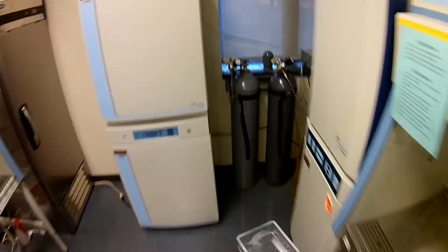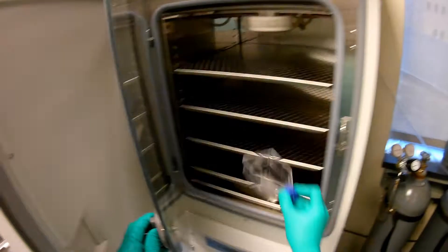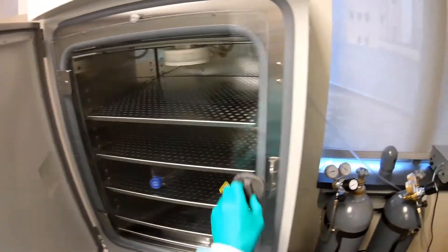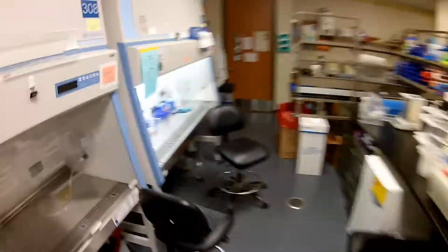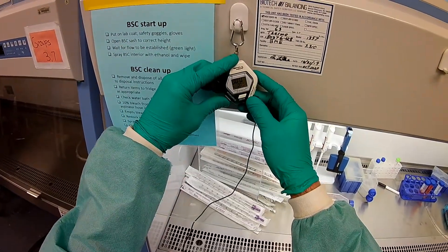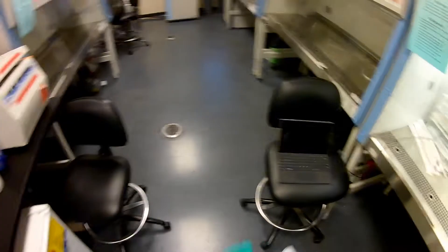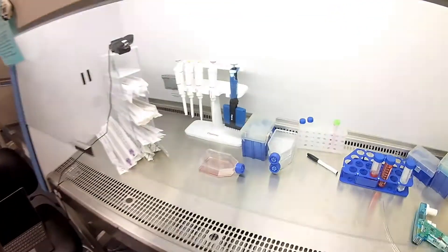Now I'm going to head to the incubator. This came straight out of the cabinet so it's already as clean as possible — I don't need to worry too much about spraying. I'm going to start a timer for four minutes. And now we're going to work on the other flask. I have four minutes to do this. It goes by quick, so I'm going to do it quickly.